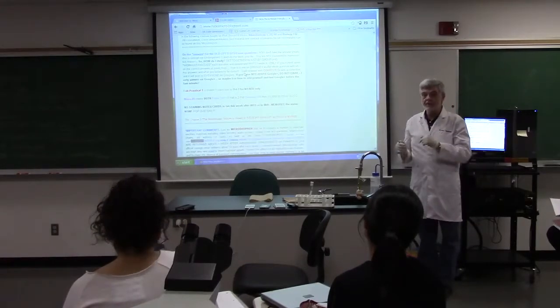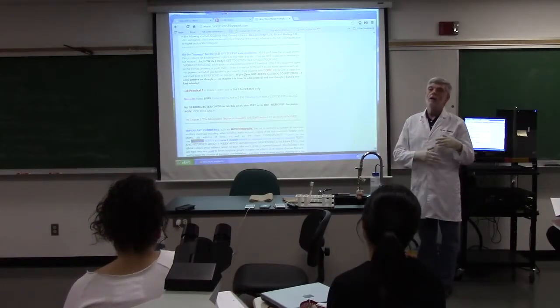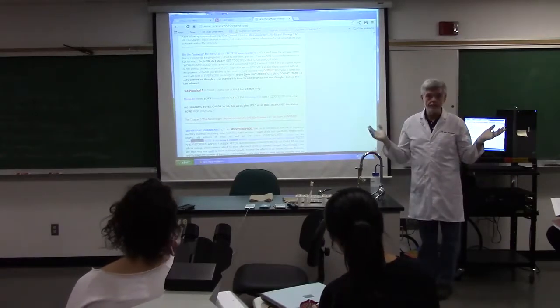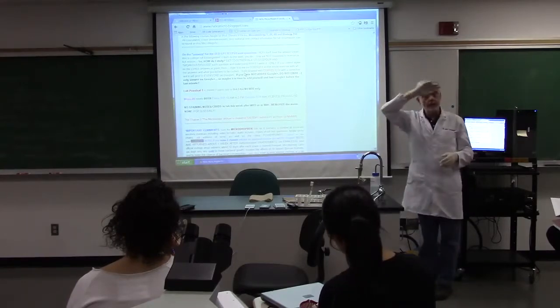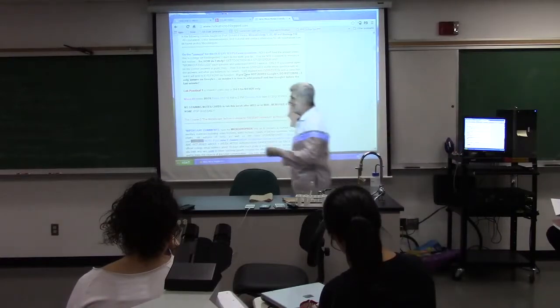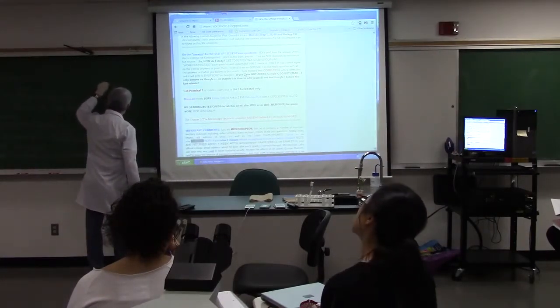So if you went over the question and you know why I was asking what I was asking, like, if you see something flowing like a river, what does that mean? Not heat fixed enough. Okay, what else would he say? Well, he said there were some other things he saw, like if you saw something that looked like a halo. Remember, here's your microbe, and you see this around it.